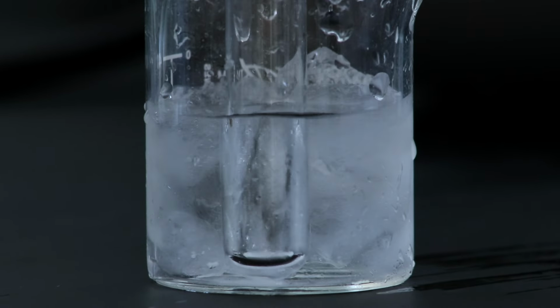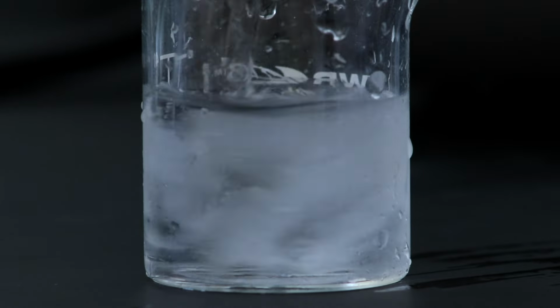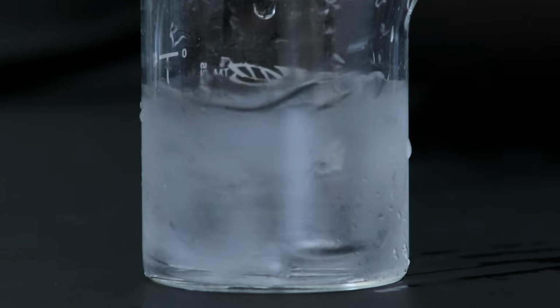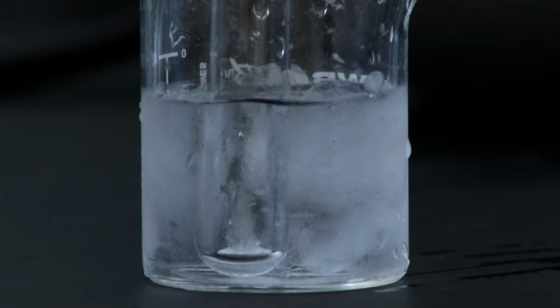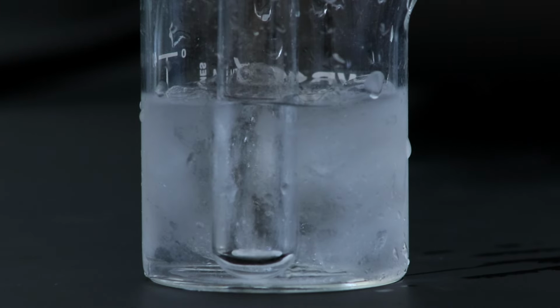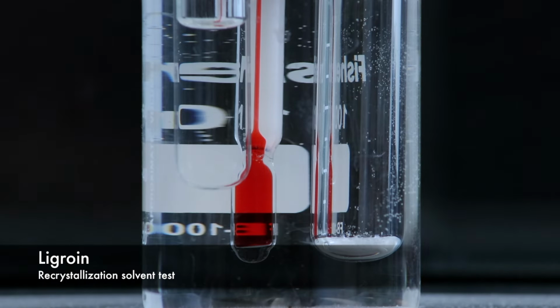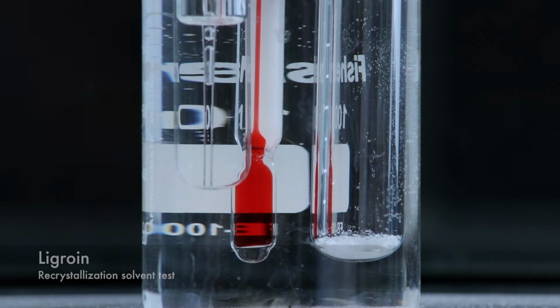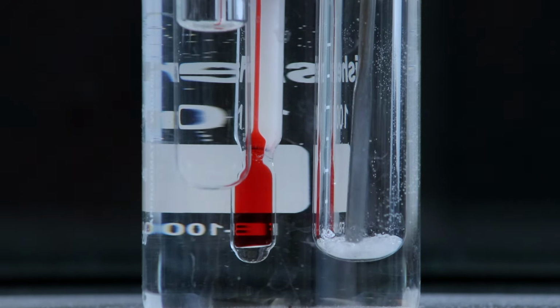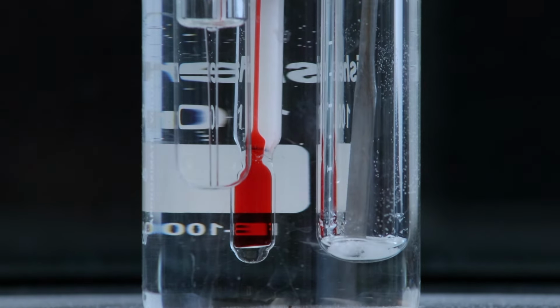I put the test tube in there for a few minutes, moving it around, even scraping the sides of the glass with a spatula, and nothing came out of solution, so straight ethanol is probably not the best solvent to use. I might be able to use a water ethanol mixture, but first I want to try out using ligroin to see if that works better. I'd imagine that this nonpolar solvent would work pretty well since the solid was not soluble basically at all in water. So I'll keep adding the ligroin with some stirring to see if it dissolves.